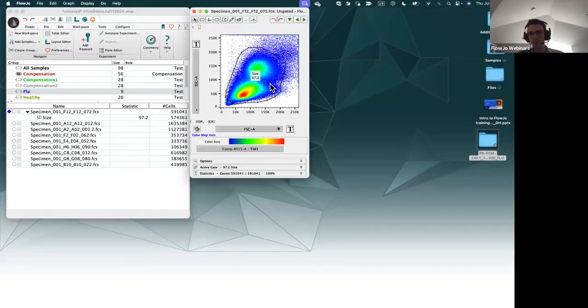So yeah, there are lots of different gate shapes we can make. Gates in general are how we're going to subset our data. This plot type is a pseudocolor plot. As I mentioned before, a pseudocolor plot shows us the density information as well as the distribution of the data. Red areas have really high densities, and when I'm saying really high, I mean really, really high, like 50+% of the cells are there probably.